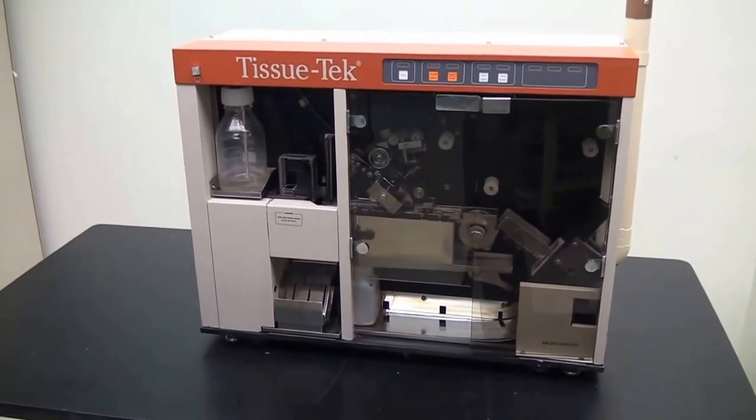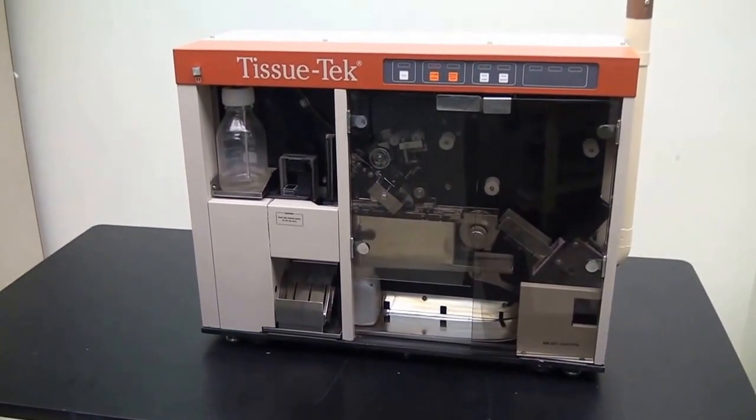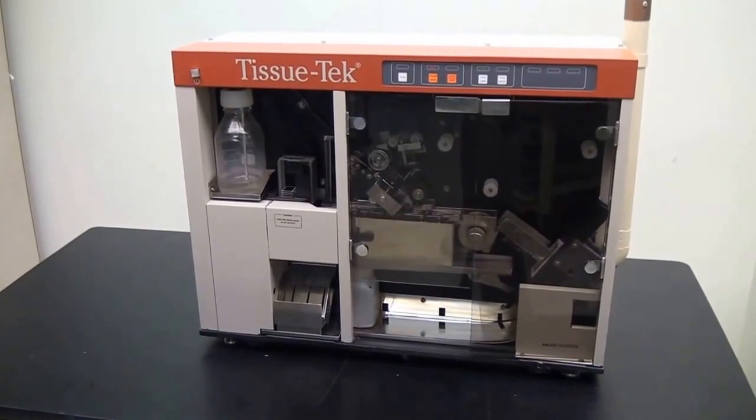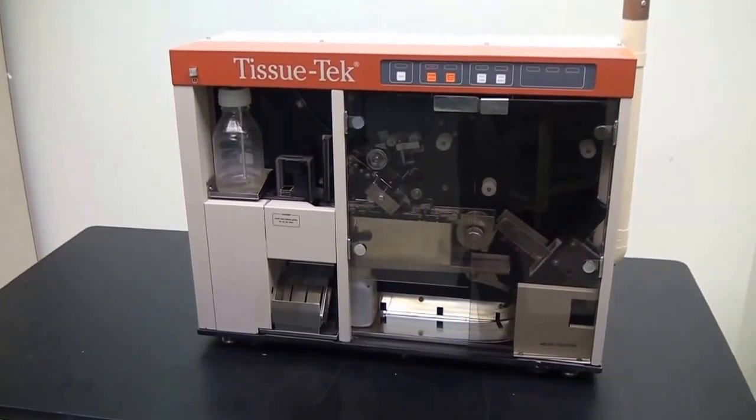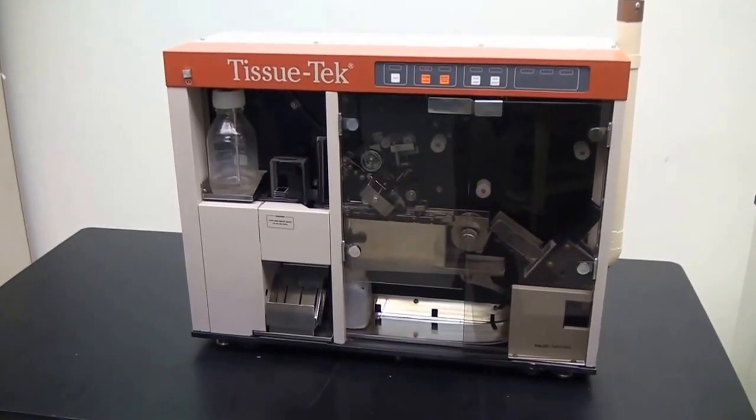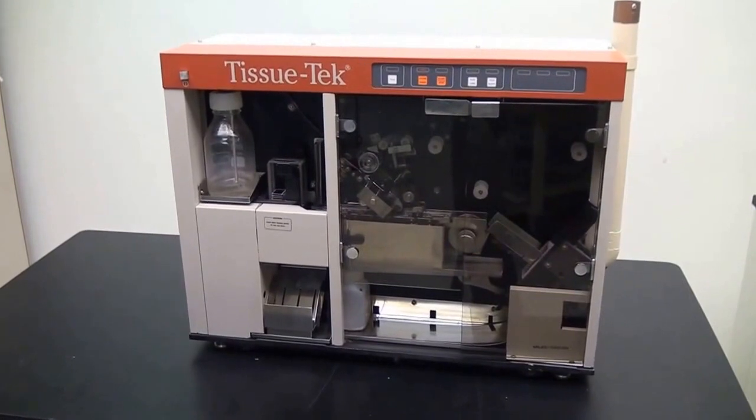Hi, this is Rich from New Life Scientific. Today we have a Miles Sikora Tissue Tech SCA 4764 slide cover slipper.